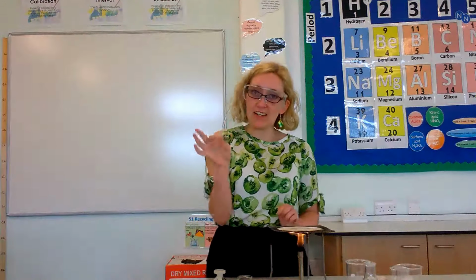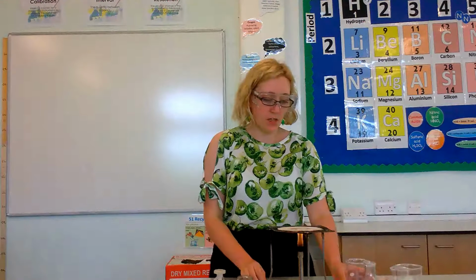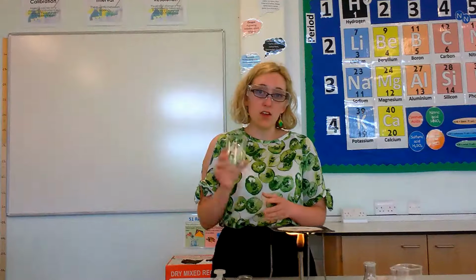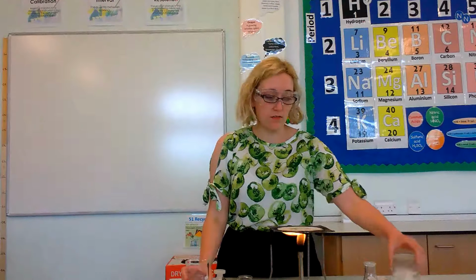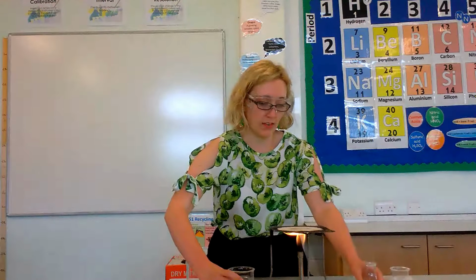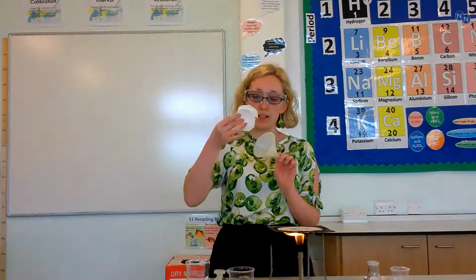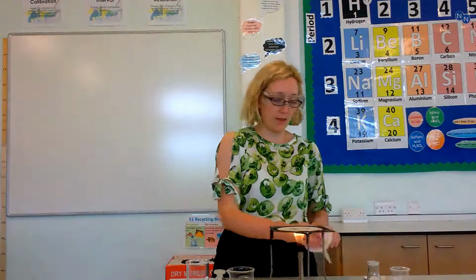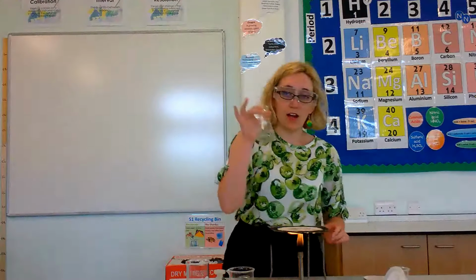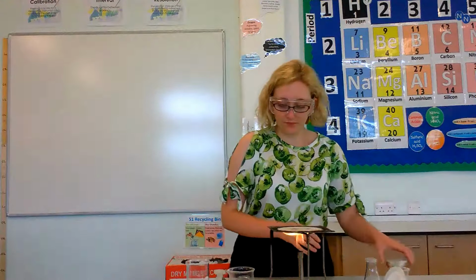We're also going to need a glass rod to stir what we're going to be putting together in a minute. You'll need 2 glass beakers, one of them empty and one of them filled, doesn't matter how much, about 200 ml of warm water. You're going to need a funnel and some filter paper, which I've already folded up and popped in there, a conical flask and an evaporating basin.